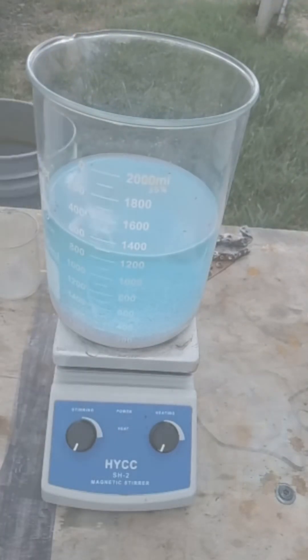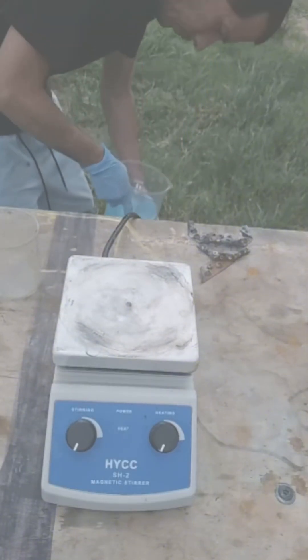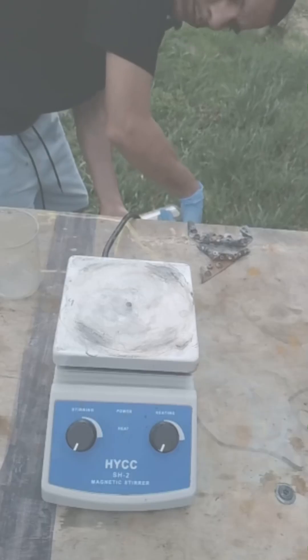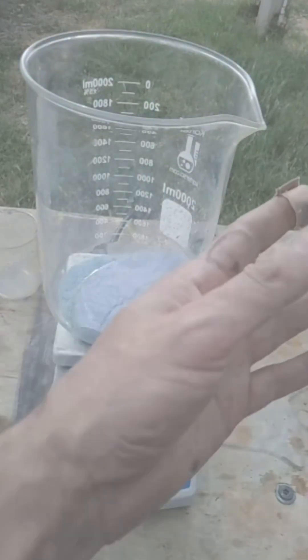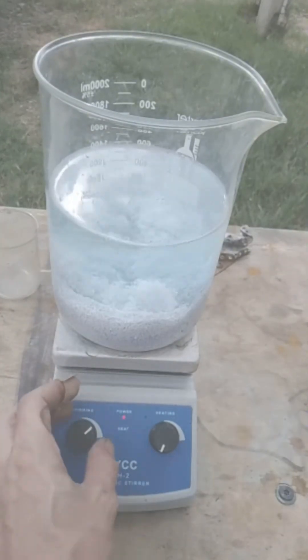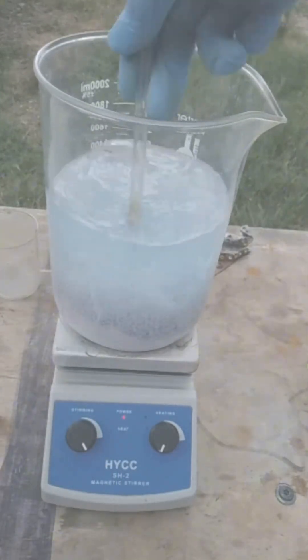So you just want to rinse and repeat, keep rinsing and repeating like you're going to see me do here, until when you put your water in there it is clear. That's going to tell you. Now, you can use pH balance sticks and all that, but you can just eyeball it. You can tell when it's gone, when it's clear it's gone. So like I said, just rinse and repeat until it is clear. So we'll move on to the next step.